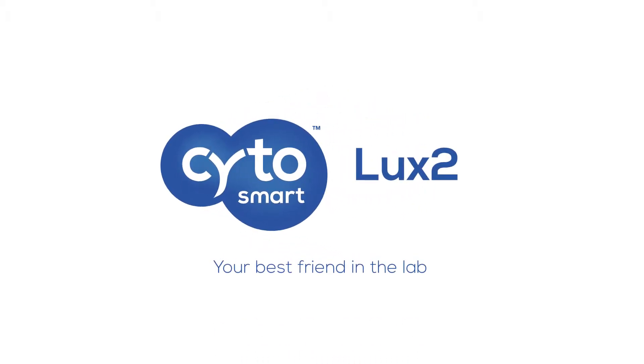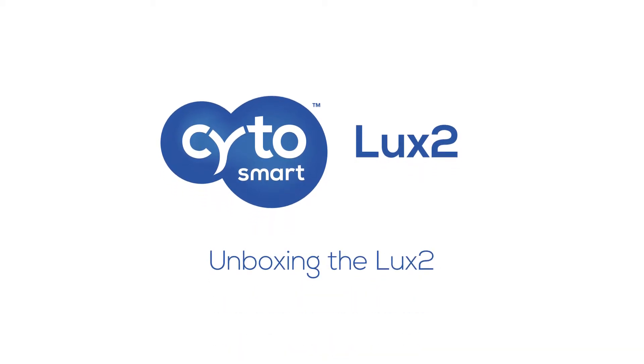Welcome to this video from Cytosmart, helping you to get the most out of your devices. Today, we'll be looking at how to unbox your Cytosmart LUX2 live cell imaging device.